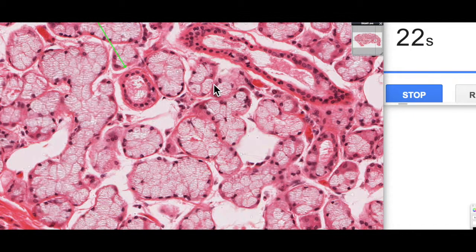Hopefully that'll help you with some identification should you run across simple cuboidal epithelium in your histology travels.